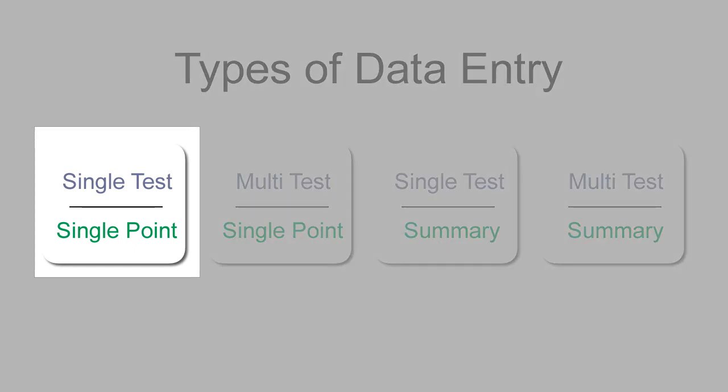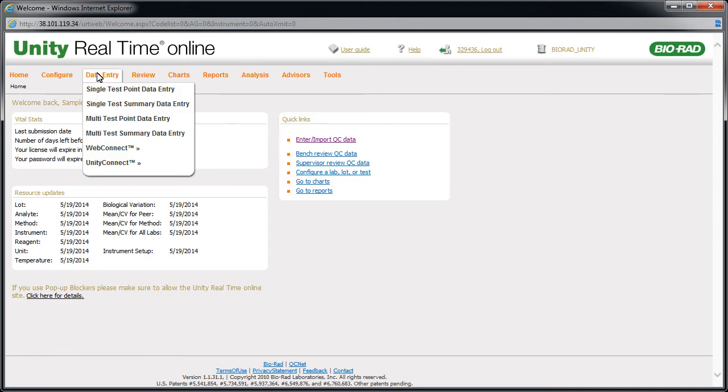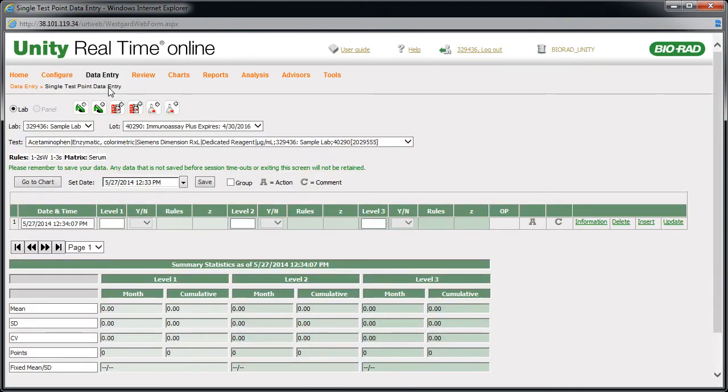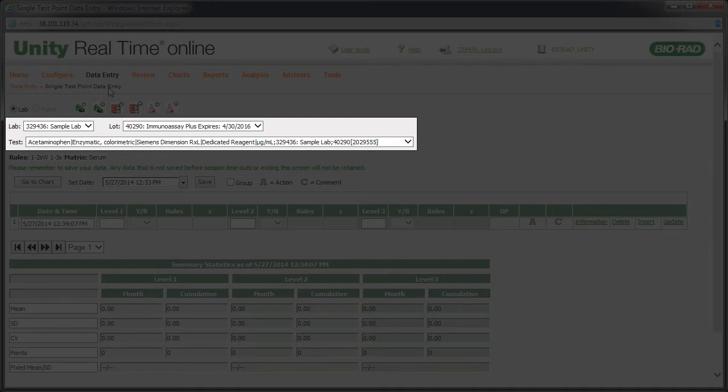Let's take a look at our first option. Point to data entry and click single test point data entry. The data entry screen appears. Select the lab, lot, and test you want to enter data for.